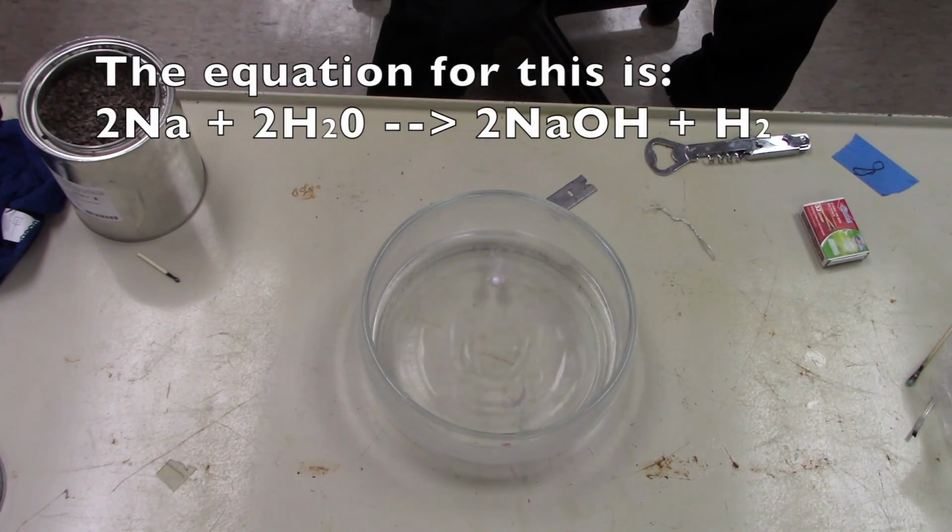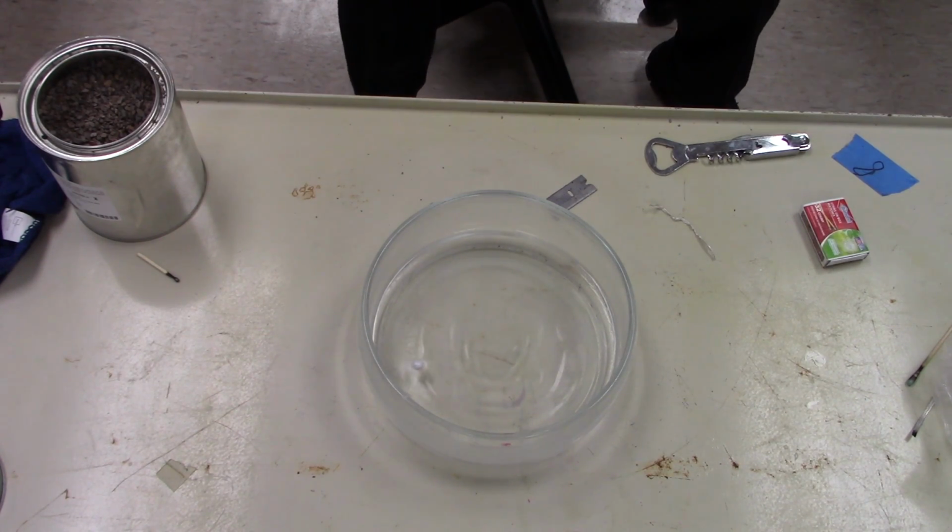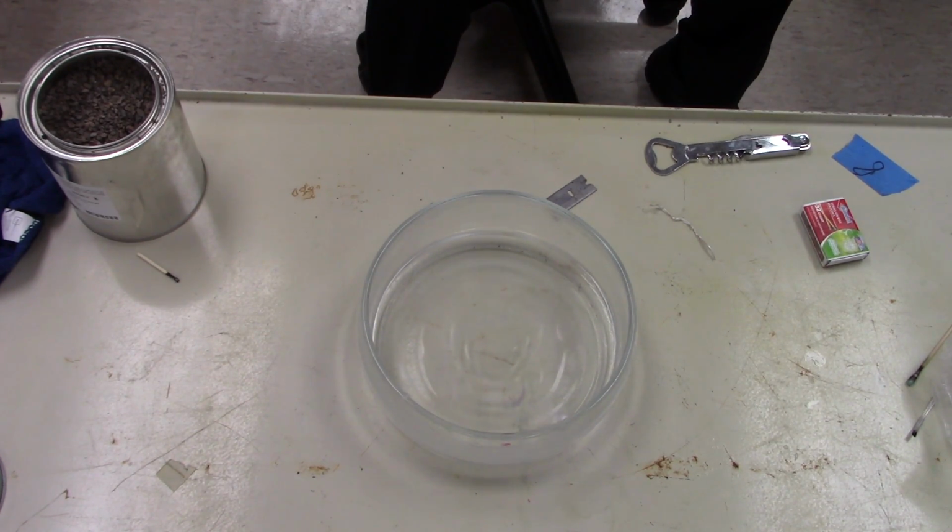Boom. So if you want to stand up so you can see, it's turned into a perfect sphere because it's molten. It gets incredibly hot when it touches water, and it turns into a molten material. And it's just going to fizz around until the entire thing has been broken up into hydrogen gas and sodium hydroxide. Sometimes when you do this, it'll actually catch fire. And sometimes it'll pop and the thing will explode.